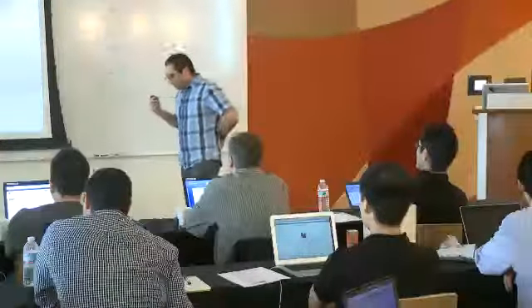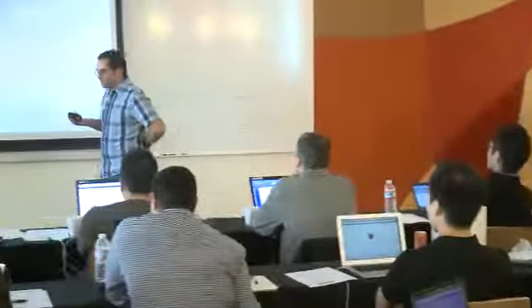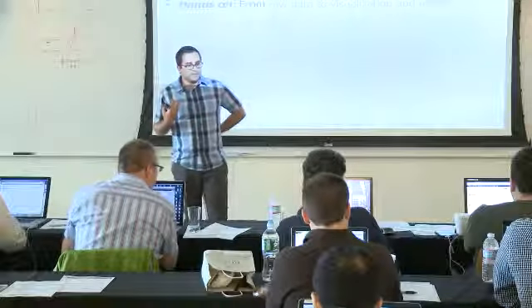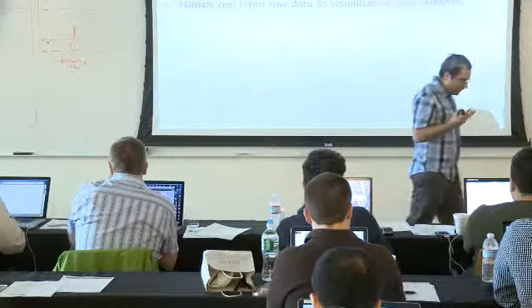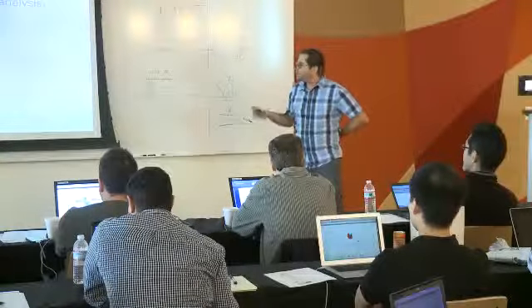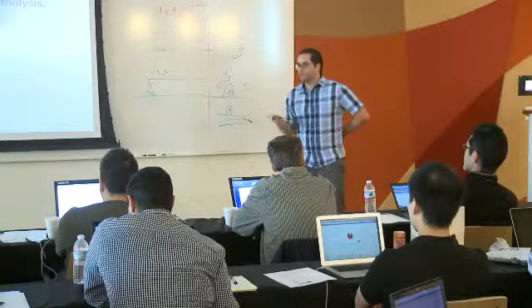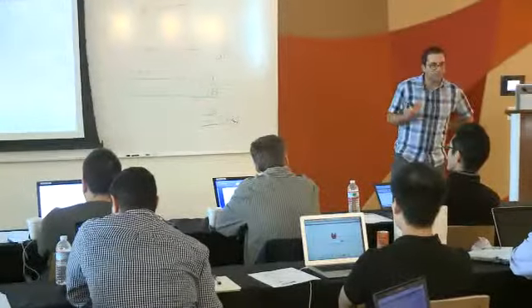I see some of you here are computational people, and there are many tools for doing what is outlined here. And I would totally encourage everyone that has no computational experience to start thinking of finding ways to get a better hold of Unix, because everything that is done in the work here is much more flexible and easy if you do it using Unix tools.